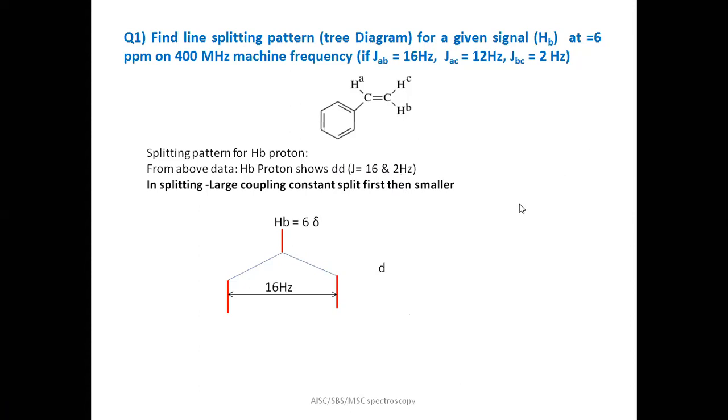So here it is also making branches. So this is giving two branches. This doublet, two lines, means two doublets. So this is making two lines here. And what is the distance between these two peaks? In hertz.